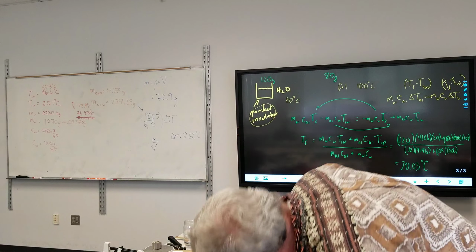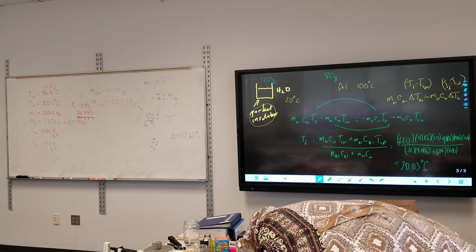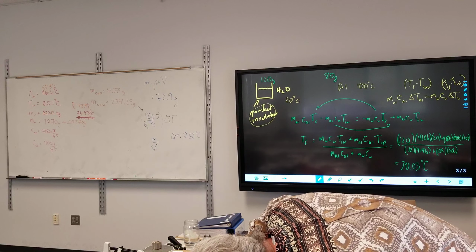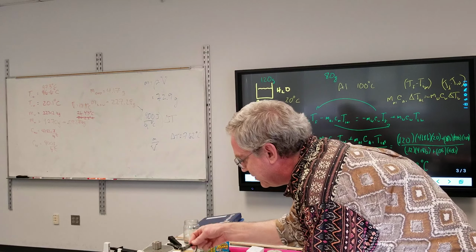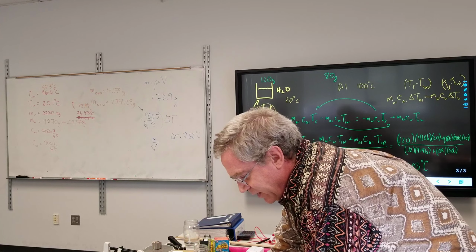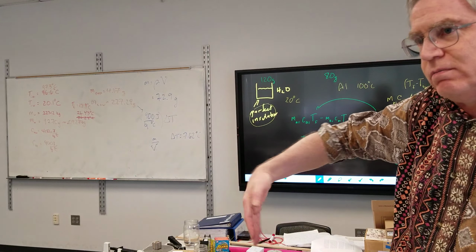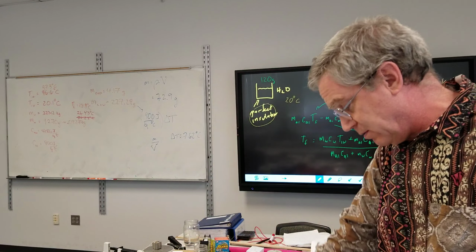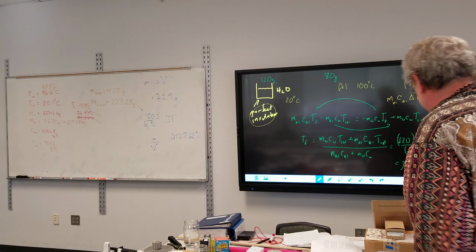Okay. All right, so I'm going to discard that data. It should be at somewhere around 100 degrees Celsius, I would expect, but now I'm going to take it out and just let it sit in the air. And so it should be cooling off, and ideally you see it dropping down very rapidly, and then it starts to level off.